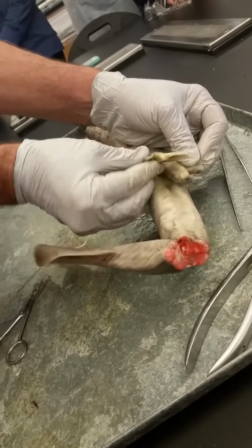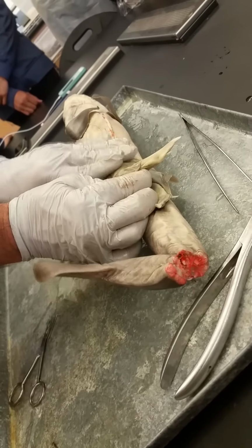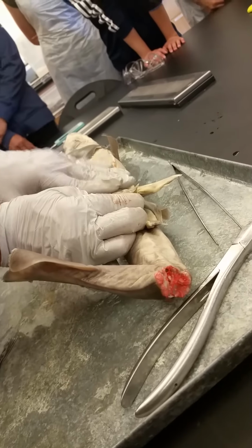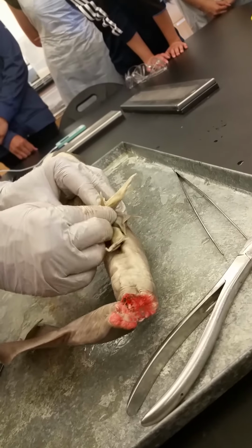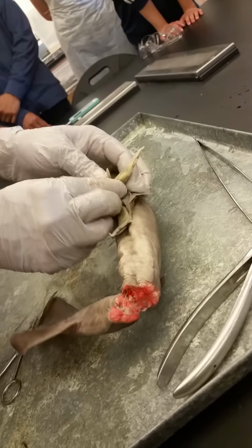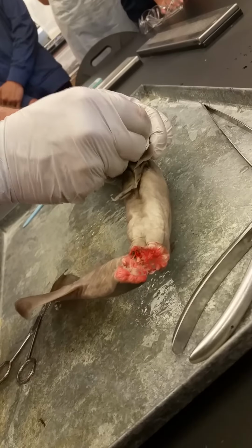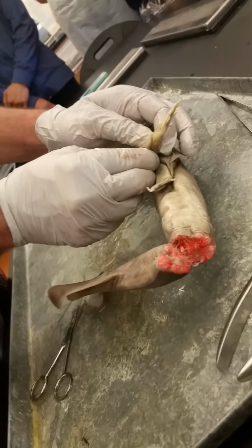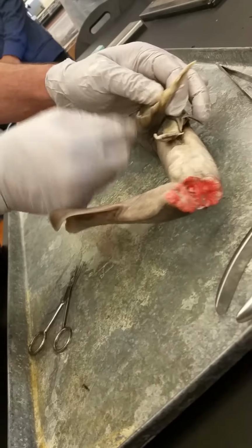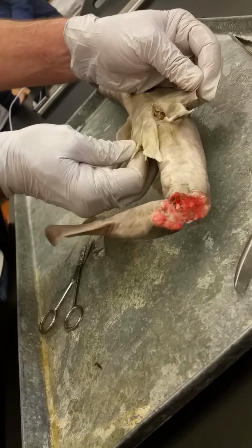And so they fold this across, and there's a little siphon gland here, so that sperm is ejaculated down this hollow tube, and then the siphon gland pumps fluids to ejaculate the fluid inside the female reproductive tract. You can see they even have little spines on them to lock them in place during copulation. But sometimes the females get even by swimming off the ends of them, so a little give and take there. Shark sex is not pretty.